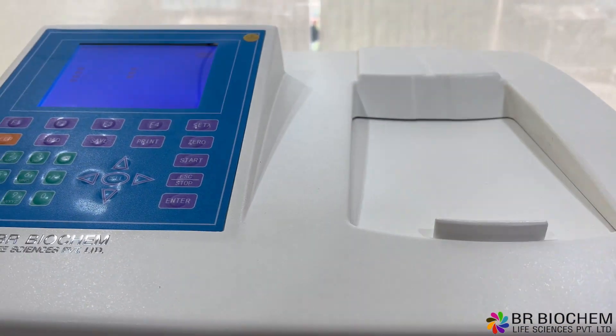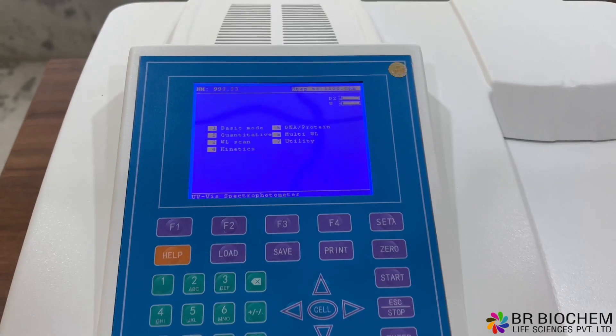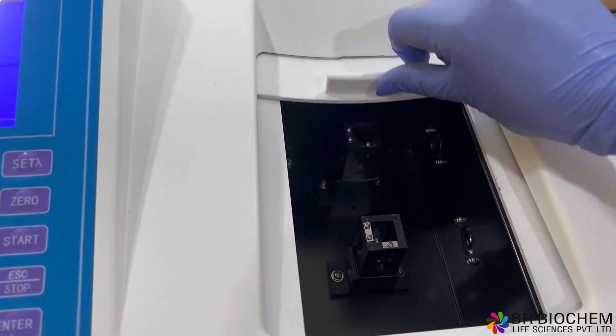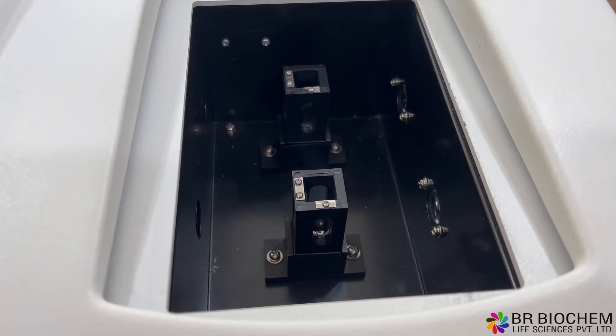The auto-setting for wavelength and blank ensures efficient and accurate measurements. Additionally, the lamps can be individually controlled, and pre-aligned lamp replacement is hassle-free.